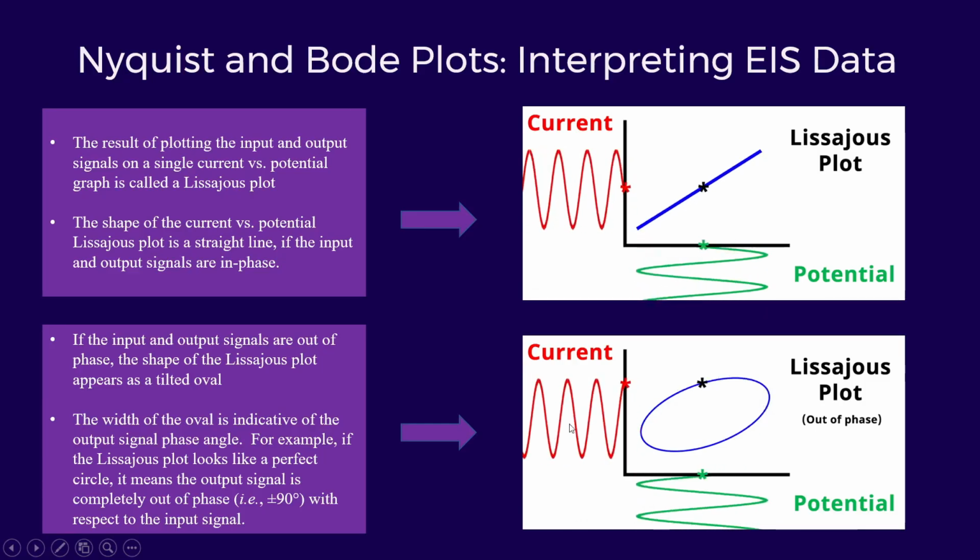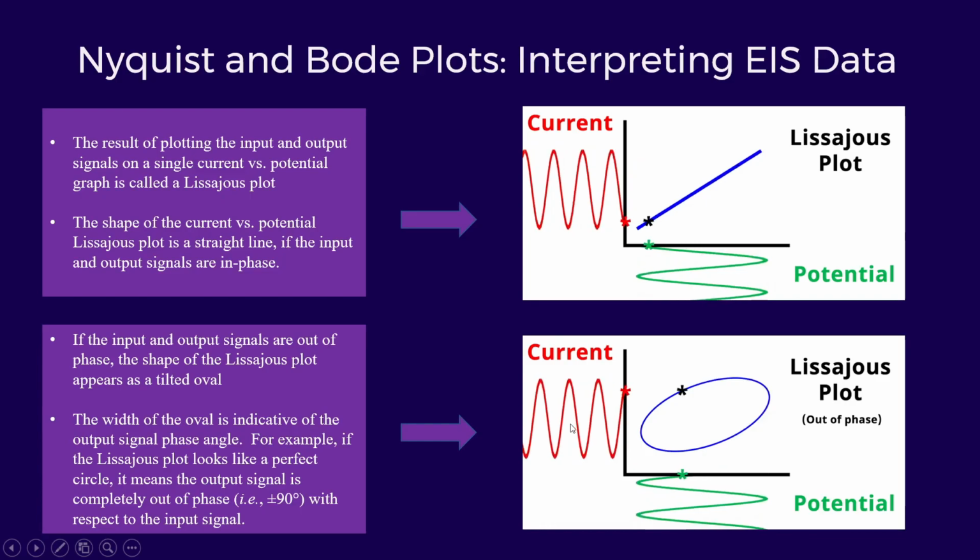That means the output signal is completely out of phase, plus or minus 90 degrees with respect to the input signal.